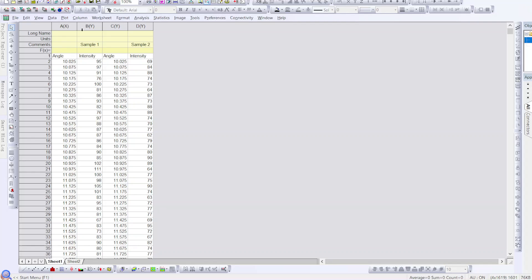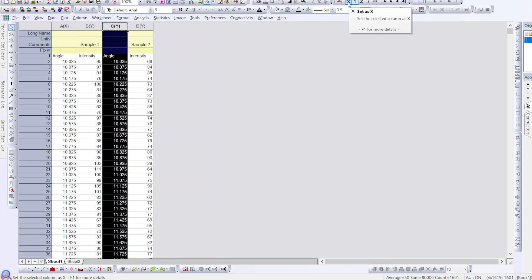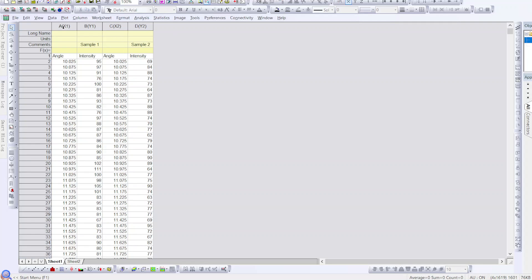I've already done that and pasted my data into Origin. As I said, angle for the XRD graph should be on the X-axis and intensity on the Y-axis. This is correct for sample one, but for sample two the default axis is shown as Y where it should be X. To fix this, select that column, go to the axis option, and select X to change it from Y to X-axis. Now you have X and Y axes correctly assigned for both samples.